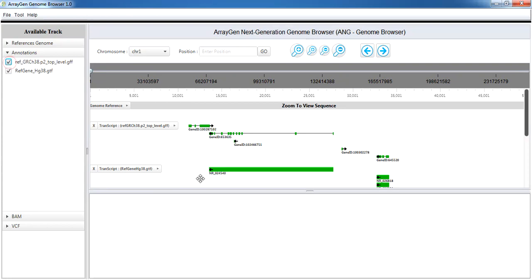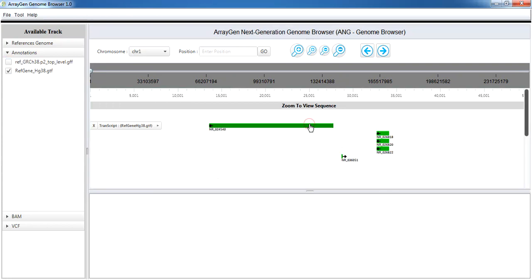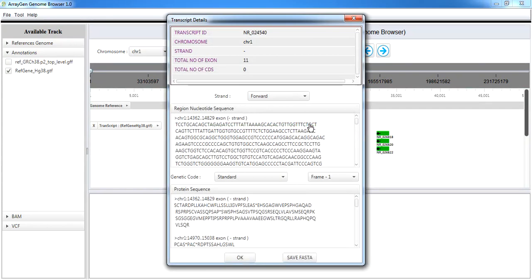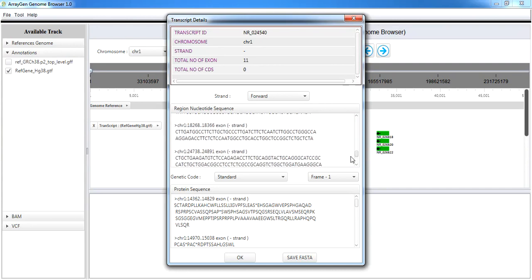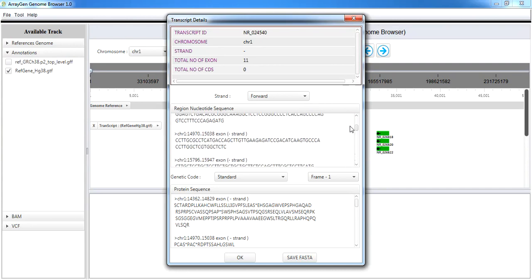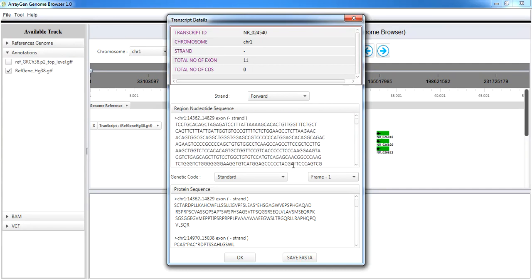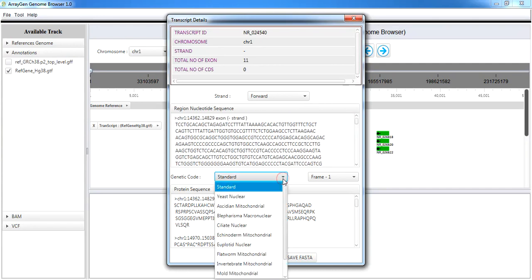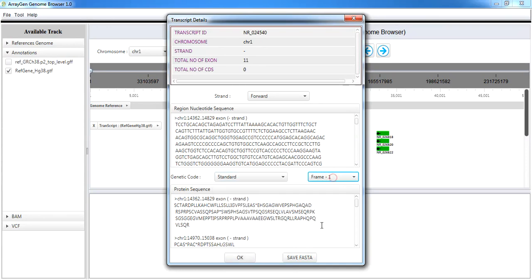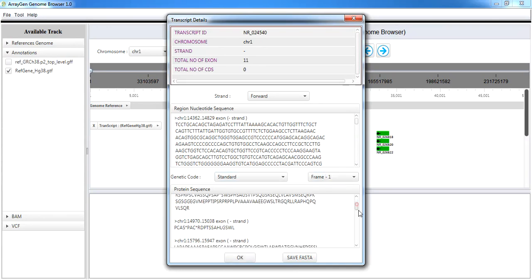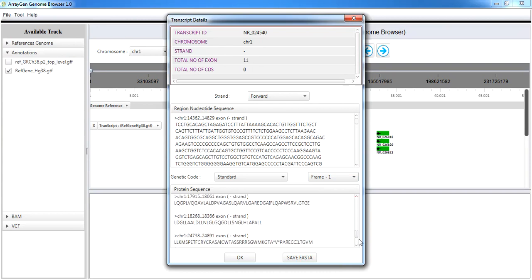Click on the gene to view transcription details like transcript ID, chromosome, strand number of exons and CDS. The nucleotide sequence is present for viewing. The genetic codes, standard and frame, can be selected. Protein sequence can be viewed in FASTA format and saved in your system.